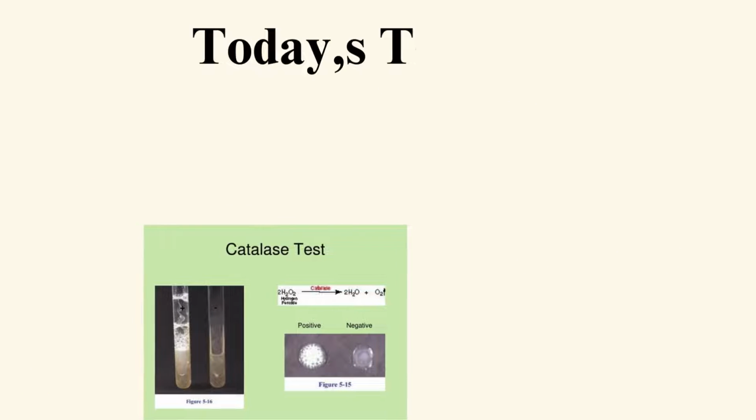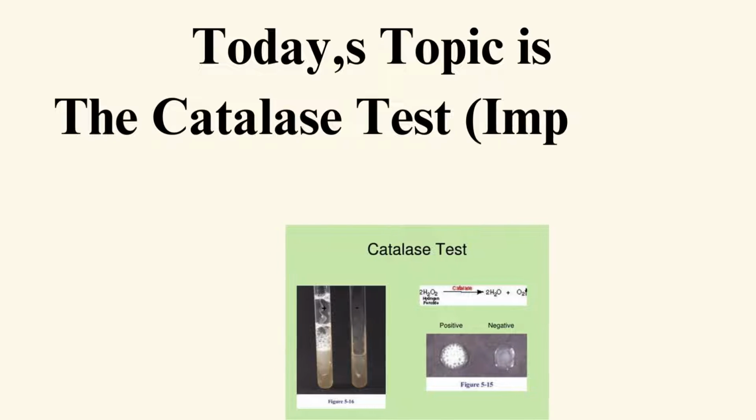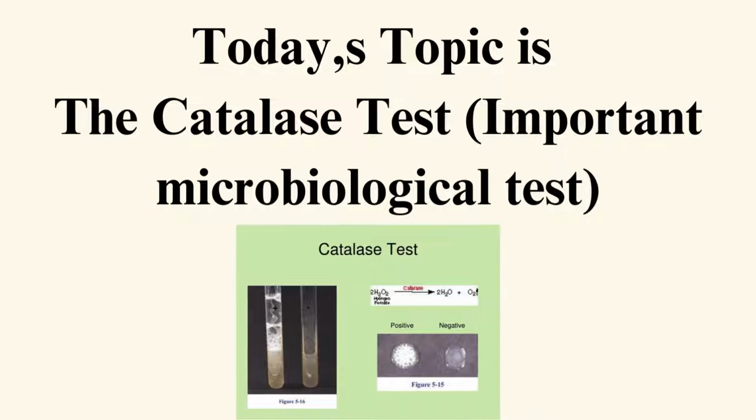Today, we're diving into a quick but important microbiological test, the Catalase test. What is it? Why is it important in pharma? Let's find out. What is the Catalase test?